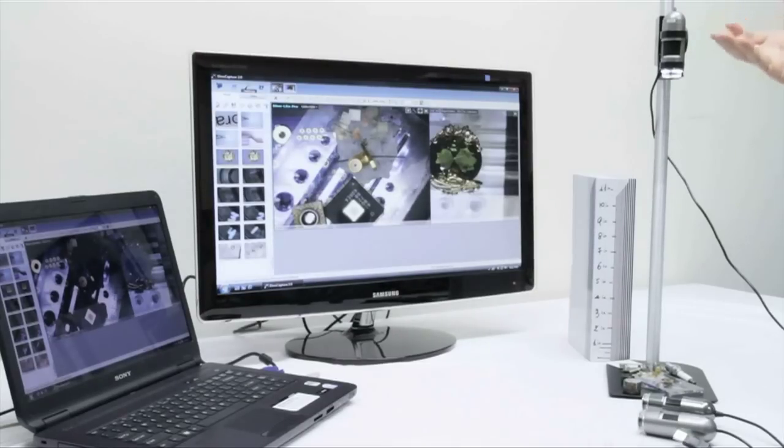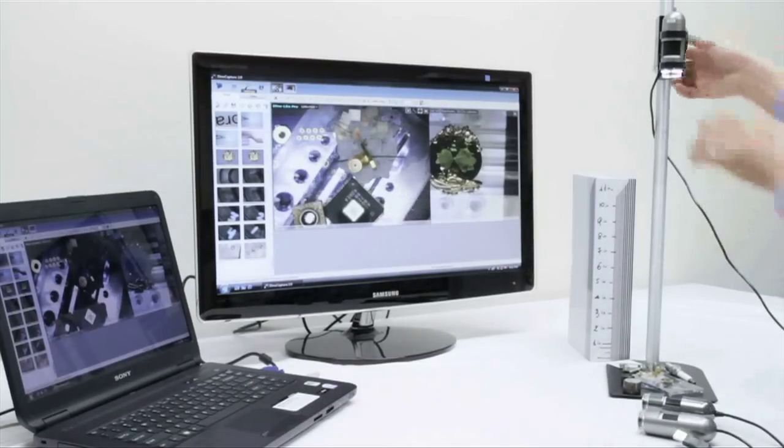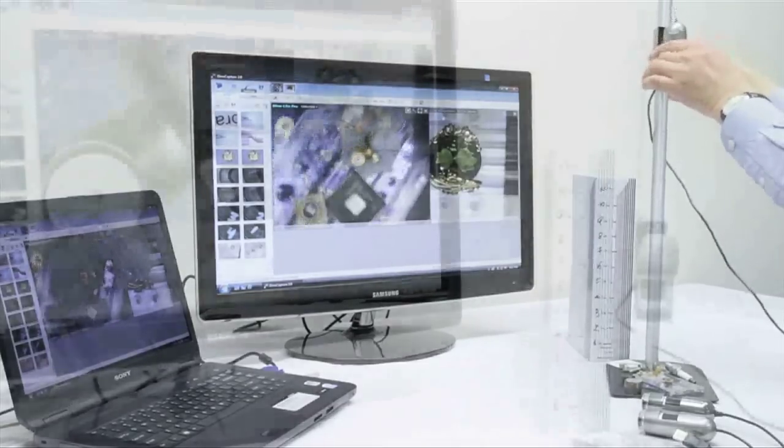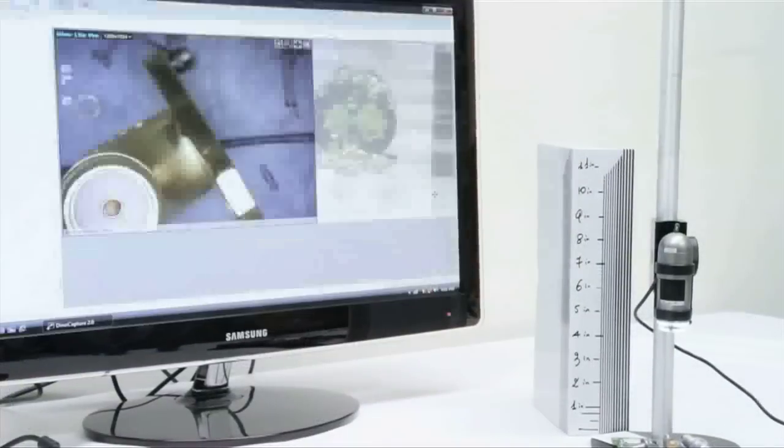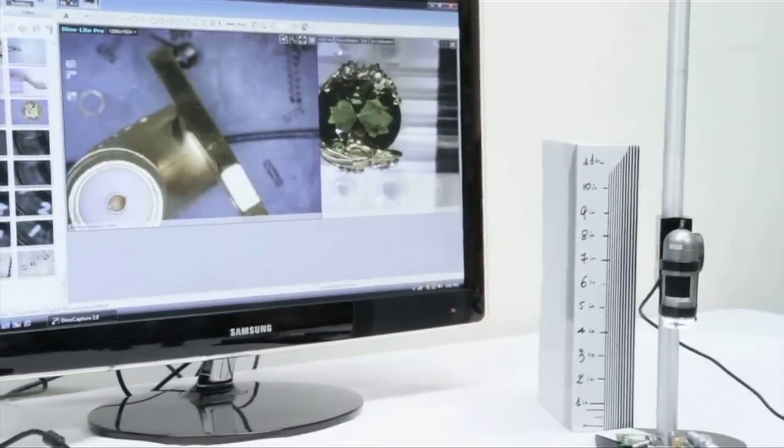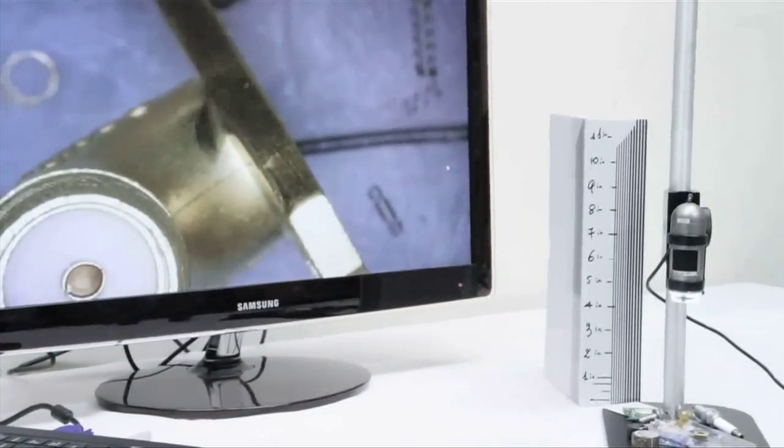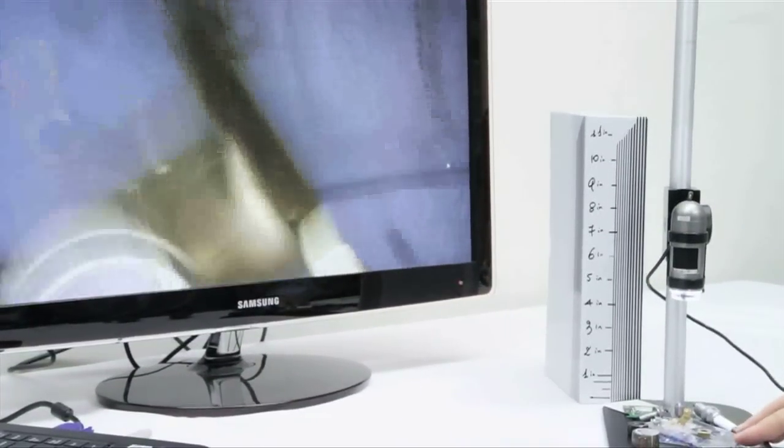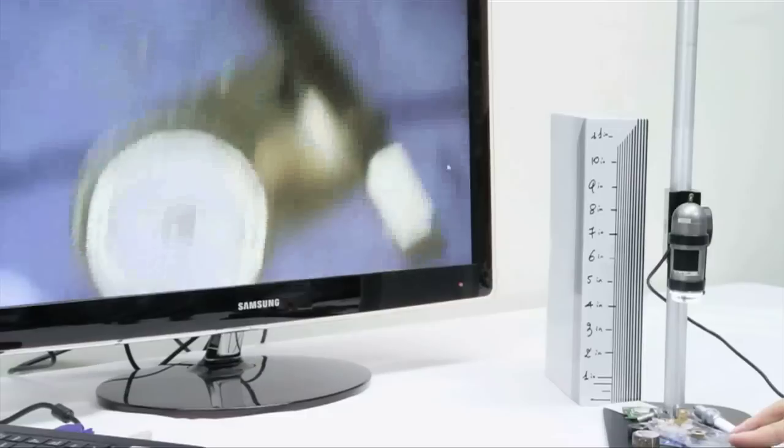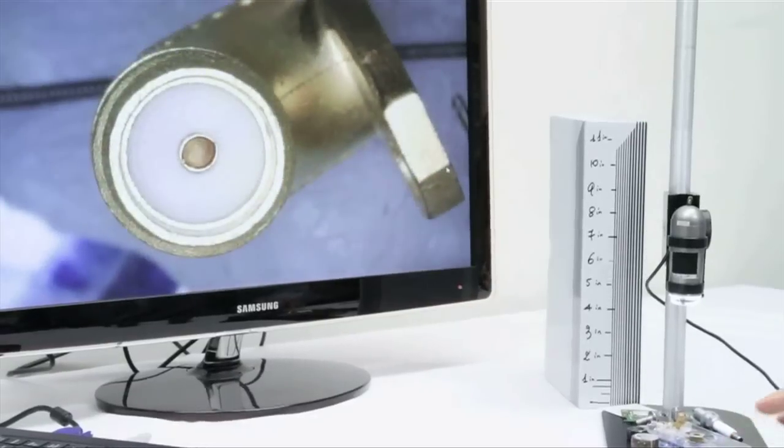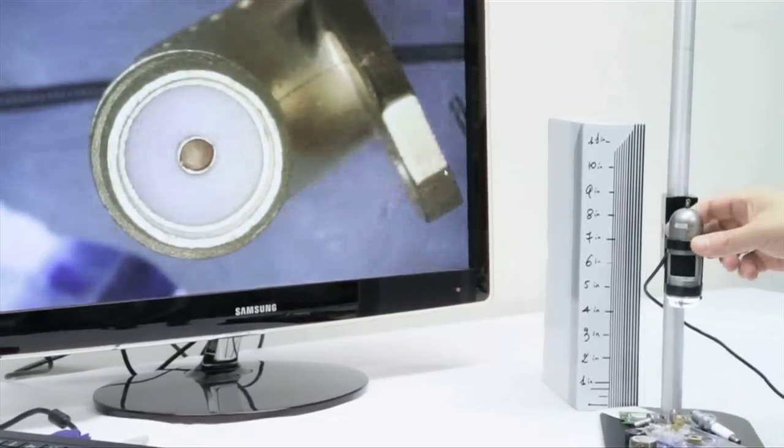So now that we have moved the microscope up, we are at about 8 times the magnification here, and you can see we are somewhere around a foot and a half away from the object.